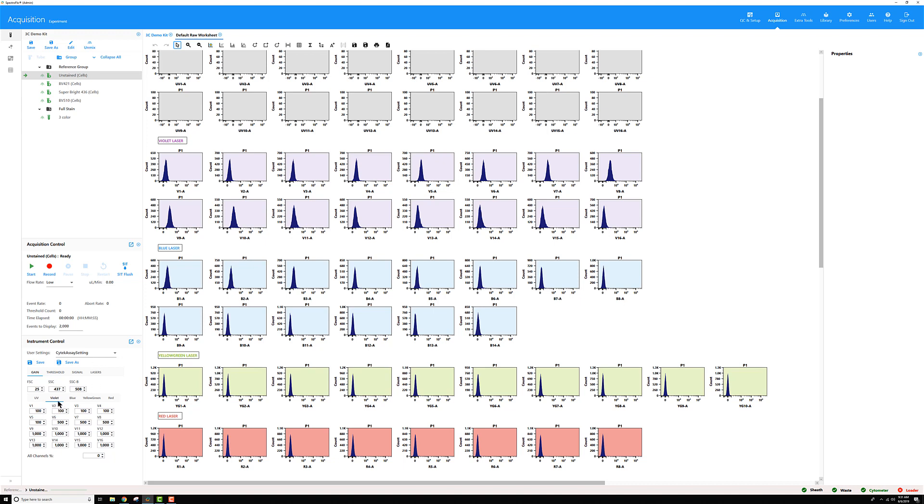Now on this one when I look at my violet channels they look a bit abnormal. There's very even numbers like someone was trying to create their own signature here and I don't like that. I want to reset it back to the system defined SciTech assay setting.